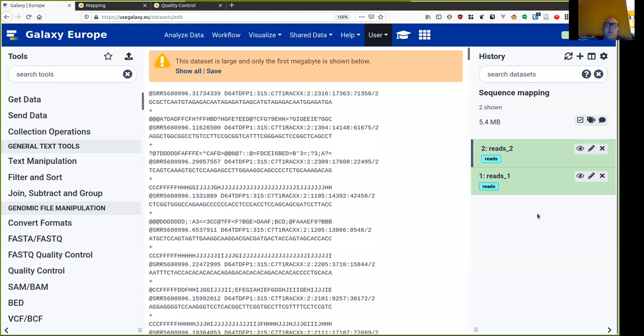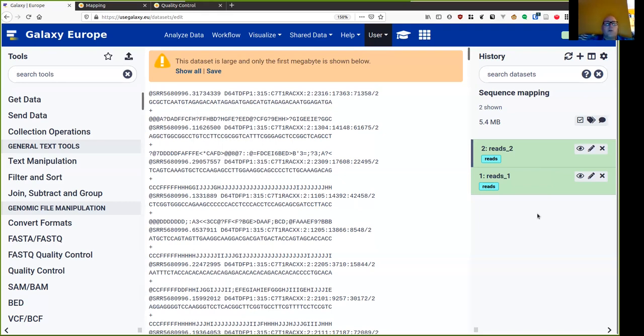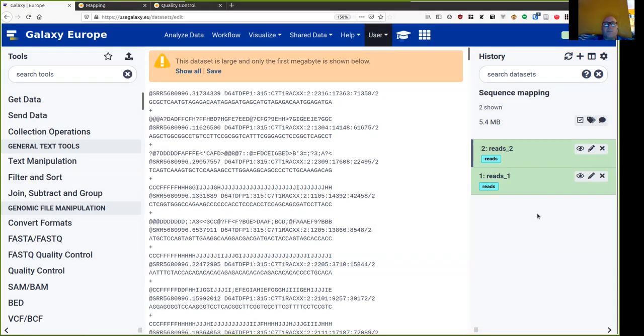For instance, in human we have hg19 and hg38. The decision as to which ones you use is largely determined by which tools you're using. Some databases are built for a particular reference genome and then you have to use that reference genome in your analysis. When we're dealing with bacteria, there are often many reference genomes because of the diversity within bacterial species.